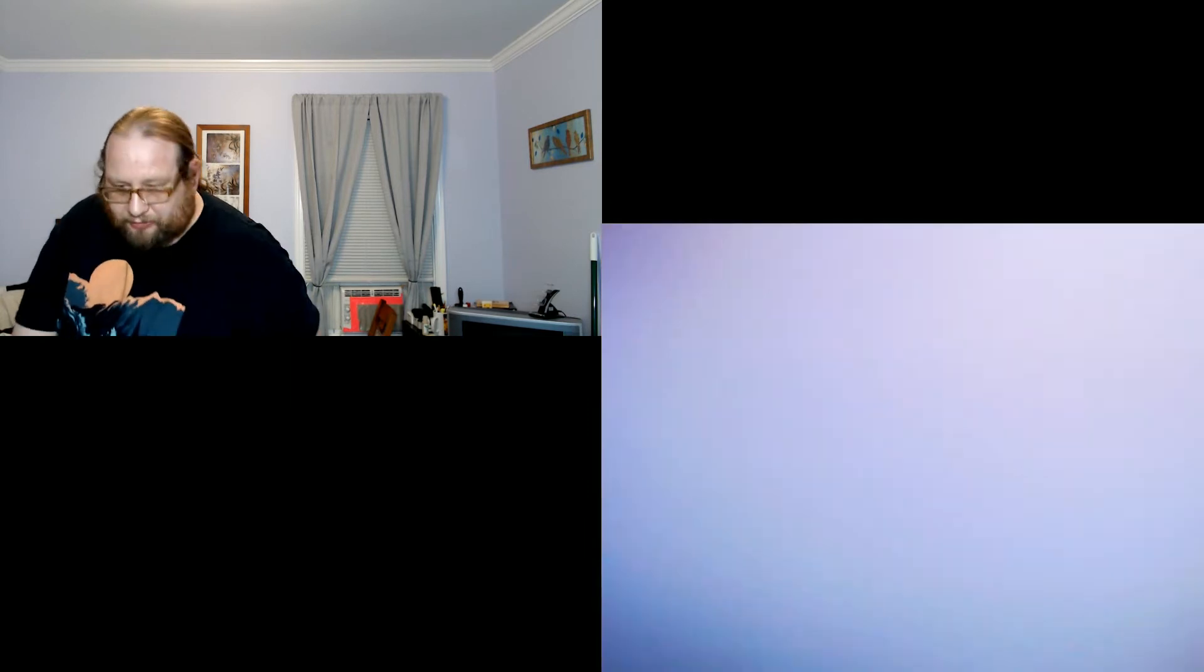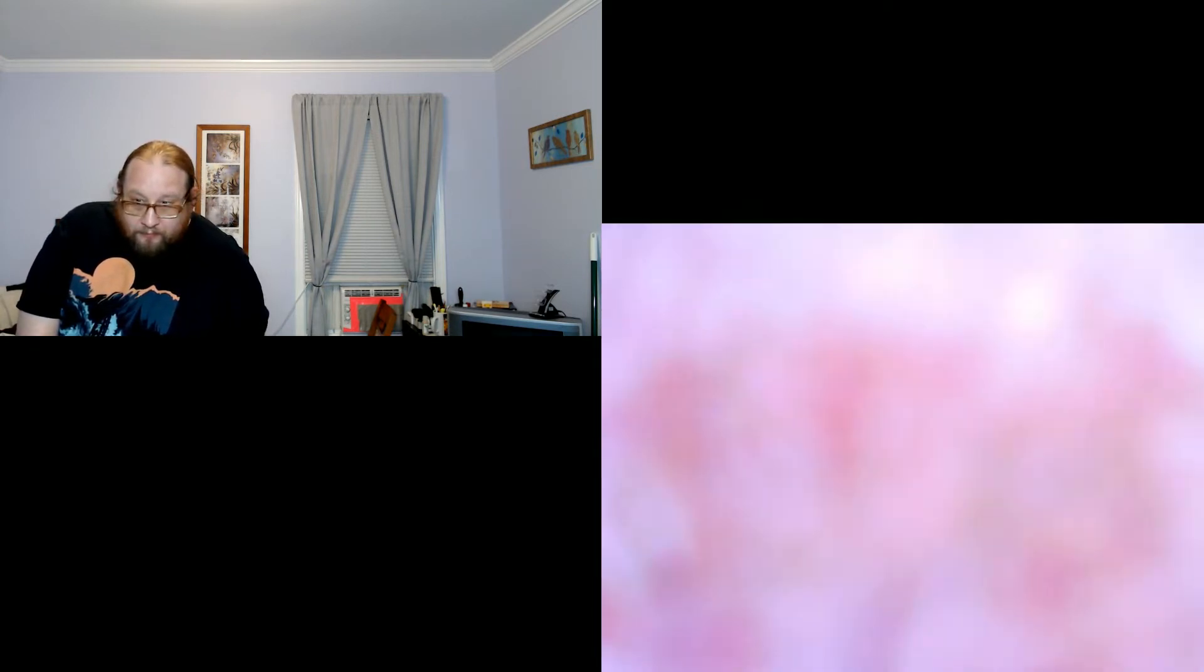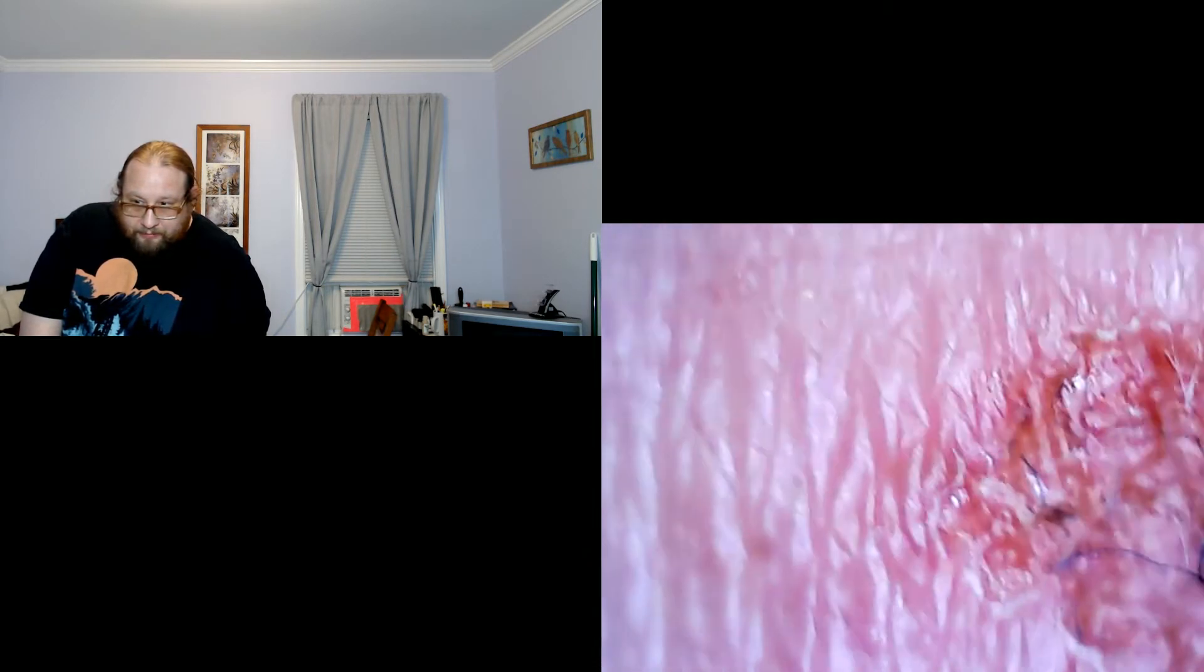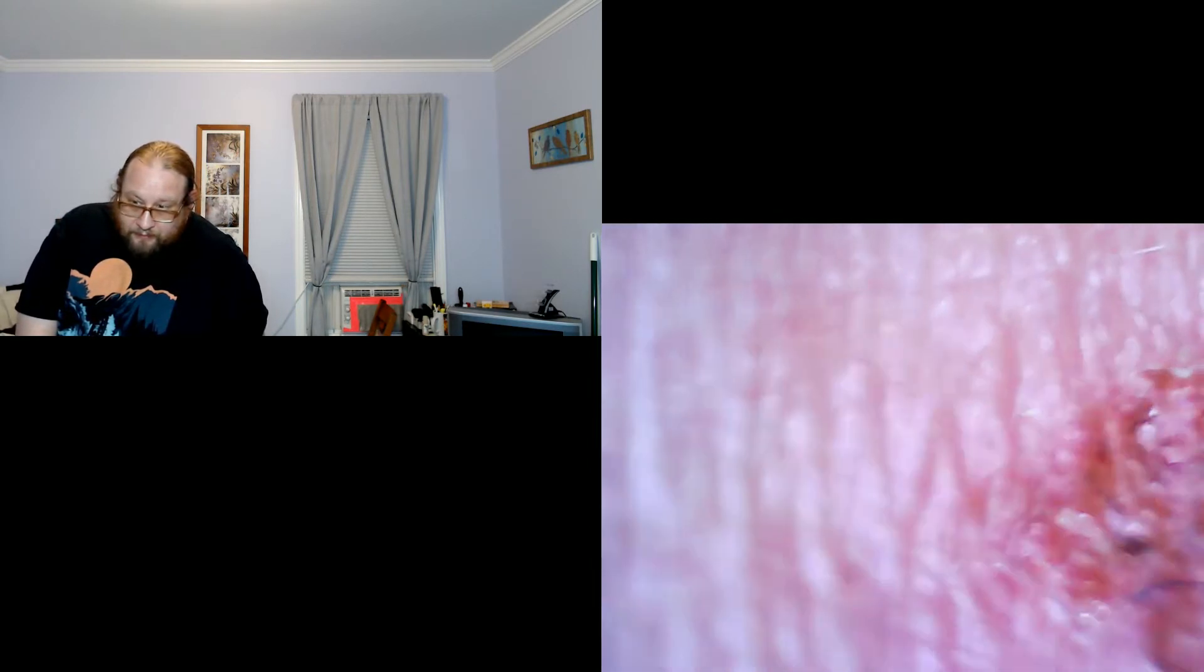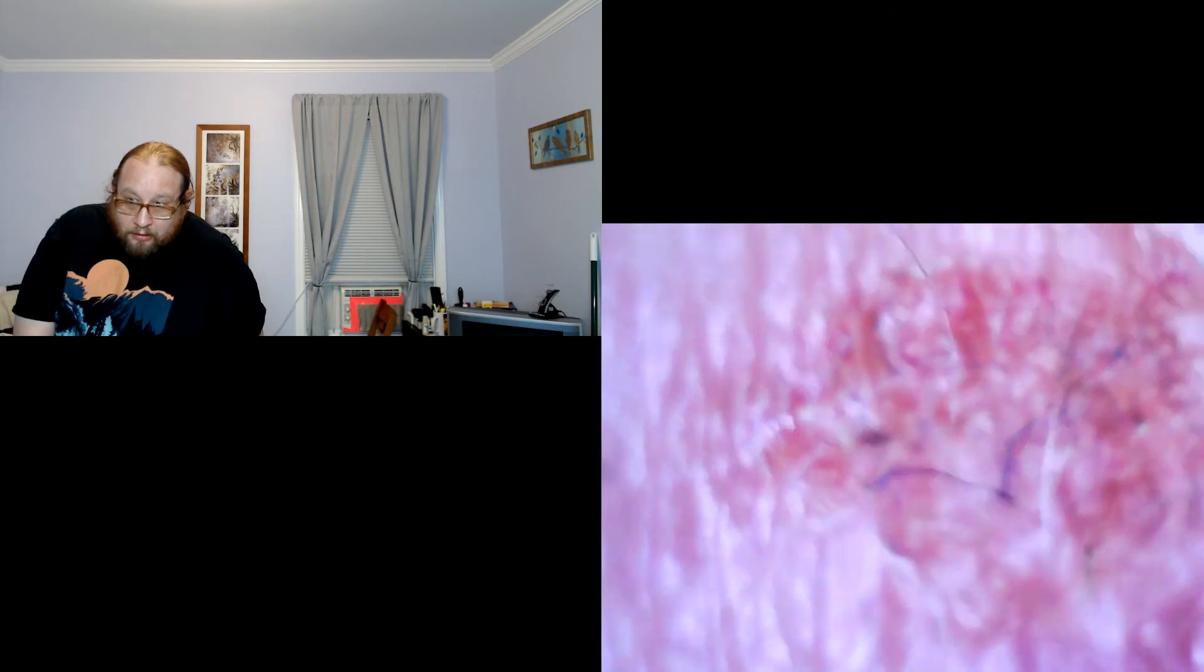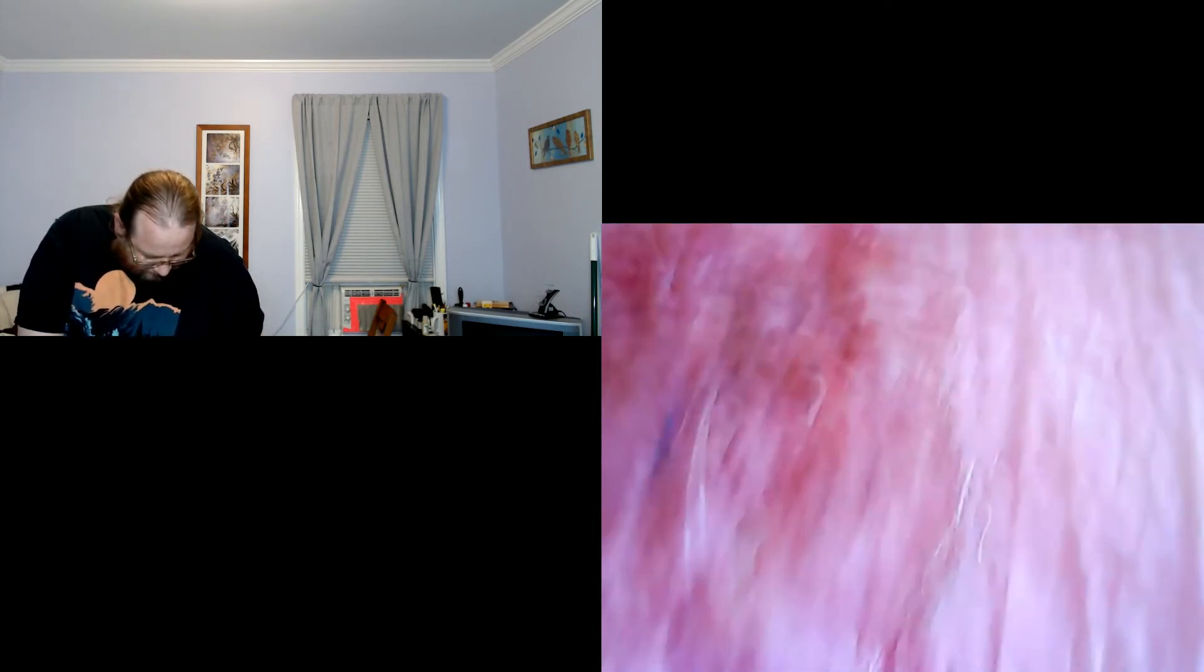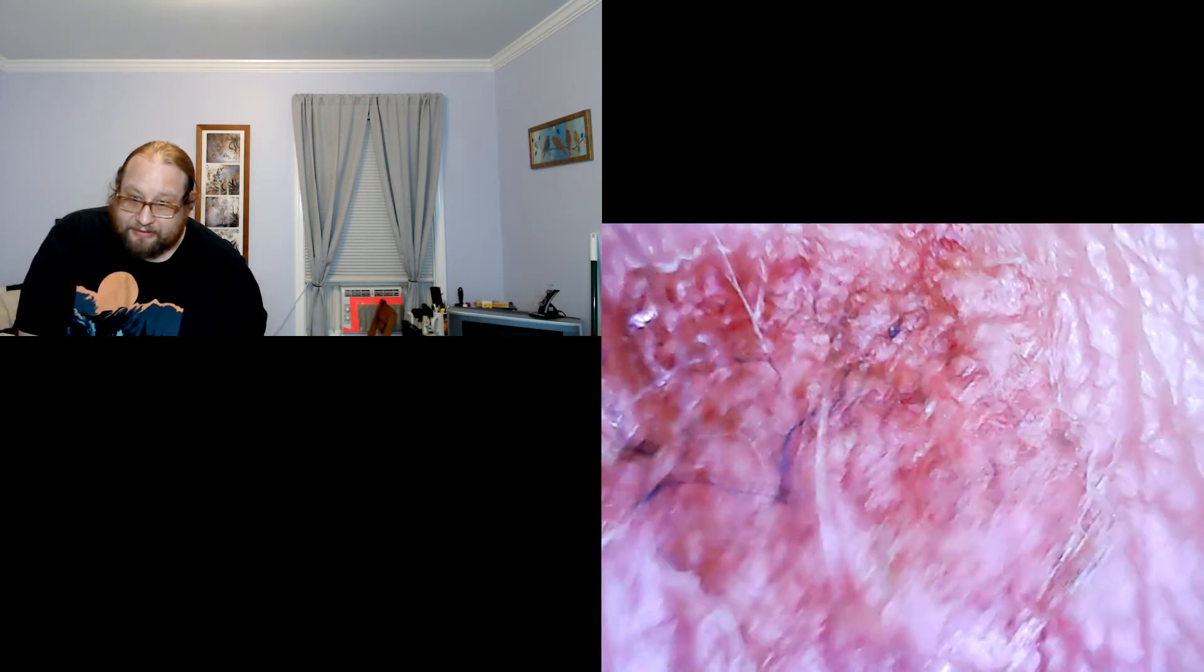This is a new one actually. This one had all sorts of fuzz coming out of it the other day. There they are.